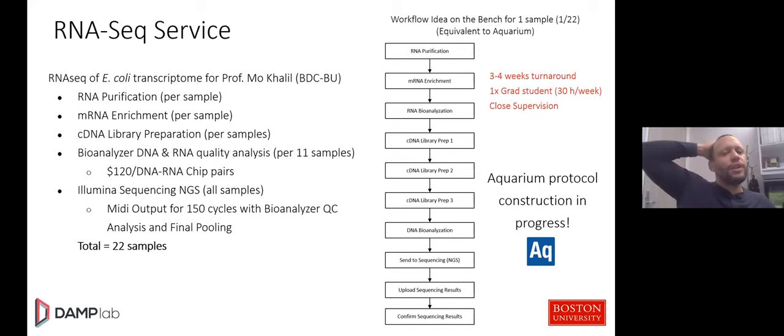The other thing we do, in addition to cloning and circuit building, is doing things like RNA-seq. So Mo Khalil, who's a professor at BU, said, yeah, I want to make use of this service. So he went through and did 22 samples to do RNA-seq with. Again, it's a series of potential Aquarium protocols in process. And the idea is, again, to be able to get a student to carry this out, go through a standardized process, and then for us to compartmentalize it and offer it to the community.